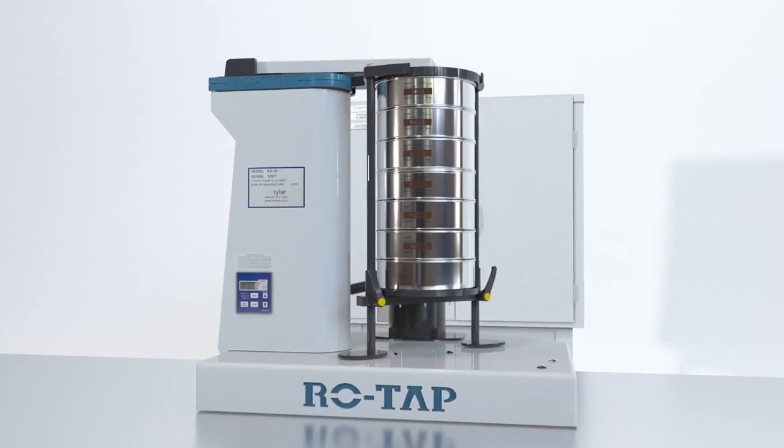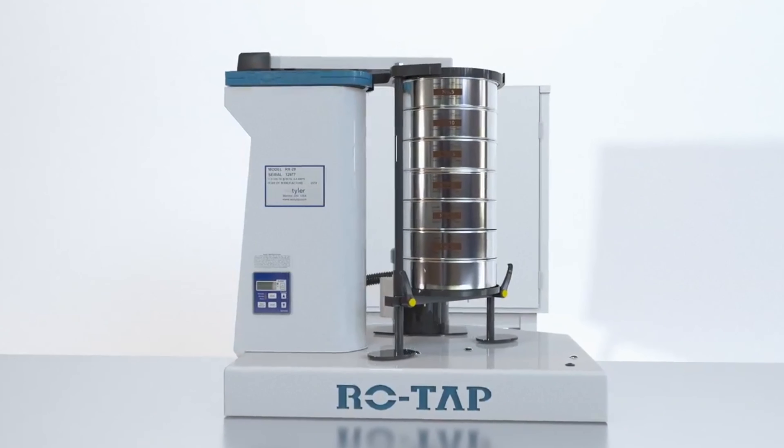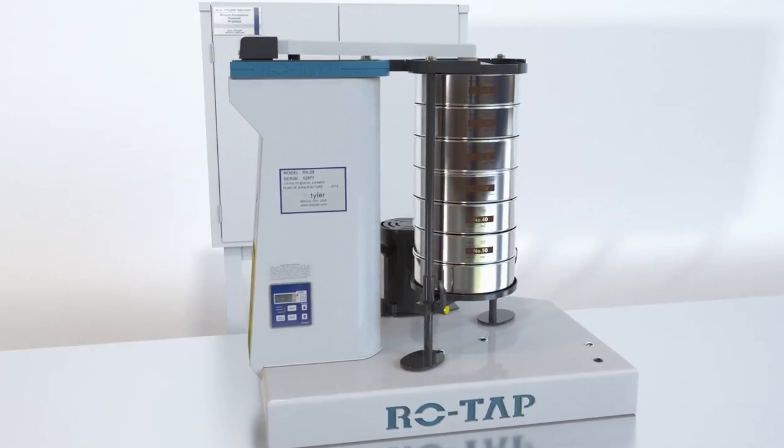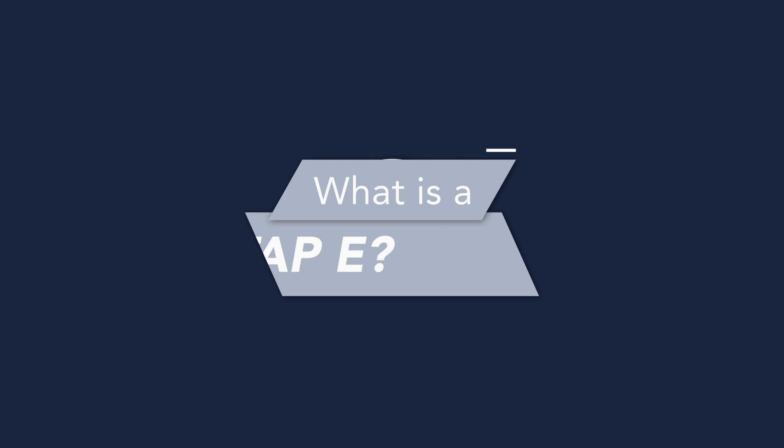We'll also have information on our mechanical RO-TAP — it'll be linked in the video description. If you have one of our mechanical RO-TAP units, it should be noted that there isn't a substantial difference in performance between the mechanical shaker and our RO-TAP E, but there is a substantial difference in the noise level and the footprint.